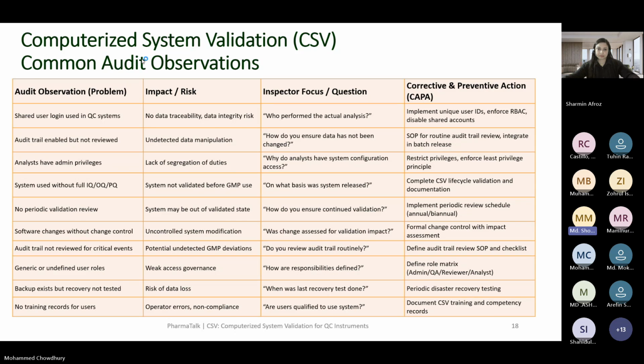I have seen that in SK practice, the admin activity should be reviewed by a third party or independent body. Periodically, every 3 months, the admin activity was reviewed by an auditor, the third party or a person who is not directly involved and has no conflict of interest, outside of the company. So my question is: is there any requirement or regulatory expectation that the admin activity should also be reviewed periodically for any system? Thank you.